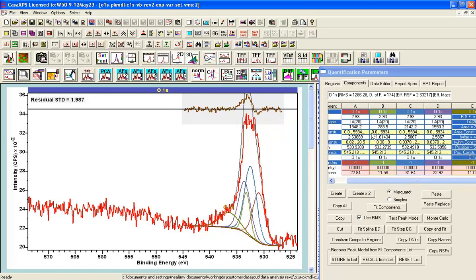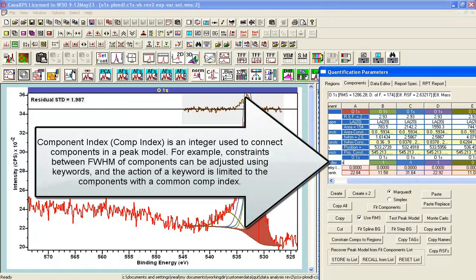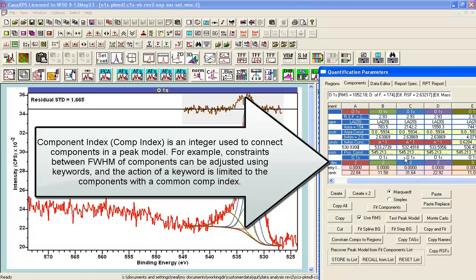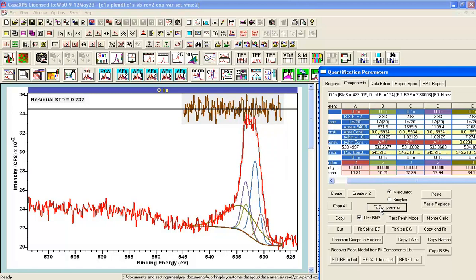This fifth one will be a broader peak that I can justify on the basis of a shake-up peak, whereas the other peaks have to be narrower and more consistent. I'm going to set a common value for the full width at half maximum across these four component peaks. This is a guess — it's probably not exactly true because one of those peaks ought to be a combination of two according to the literature, and therefore might have a broader width.